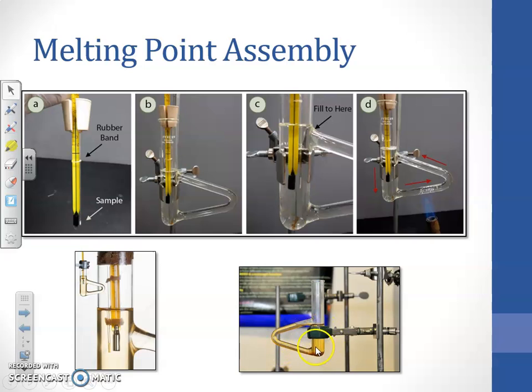So till the liquid becomes stable. Liquid paraffin will be stable, will not show any bubble or any interference, and most of the organic compounds have a melting point range below 250 degrees Celsius. So this liquid paraffin, a stable liquid, can be helpful to fill into the Thiele tube, which is a stable one.